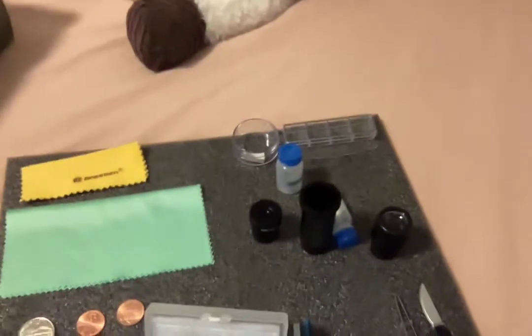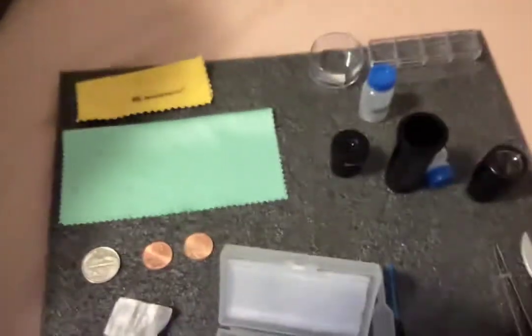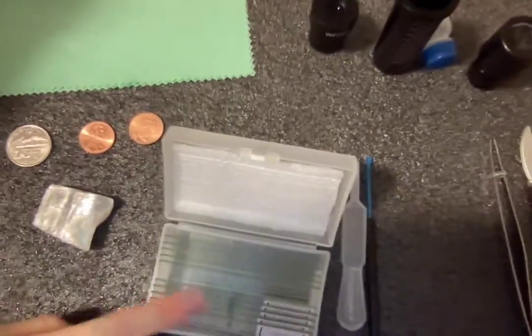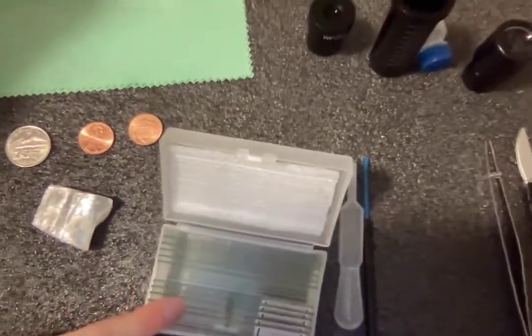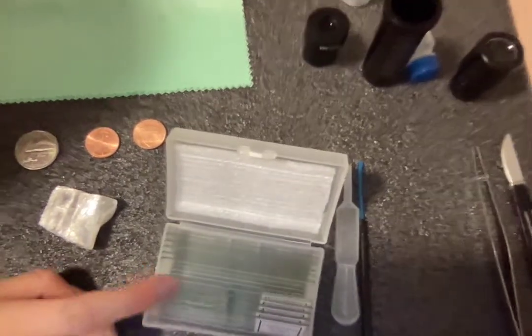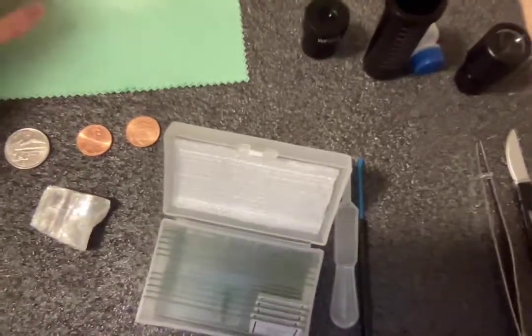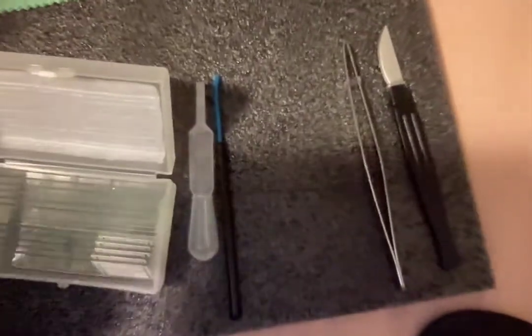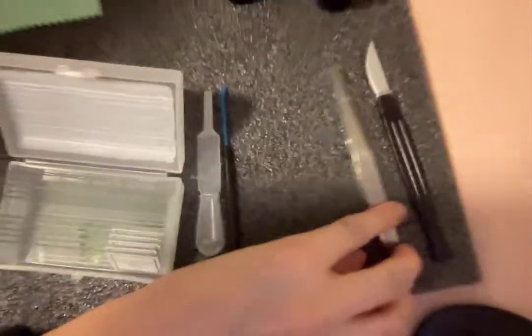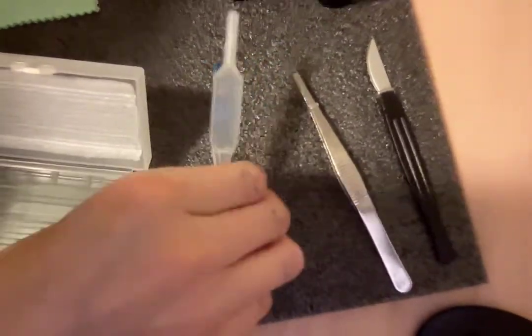It also came with these. It came with slides — about five slides that are ready to put in, and a bunch of blank slides for you to create your own. It came with two cleaning cloths, a fake knife, some tweezers, this little tool I'm not sure about, and a plastic pipette.